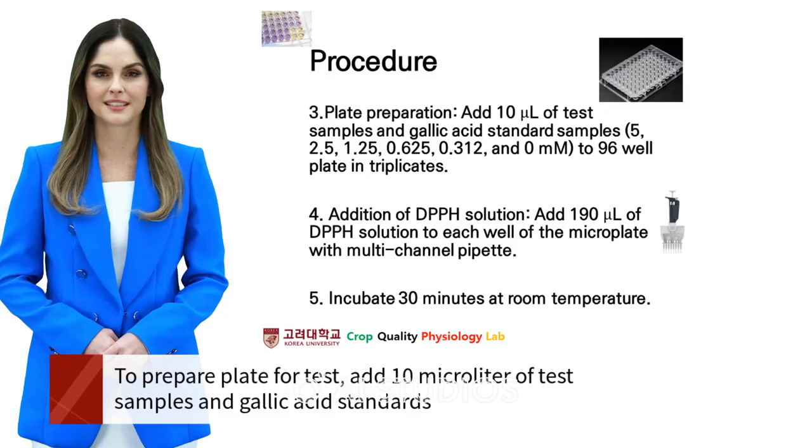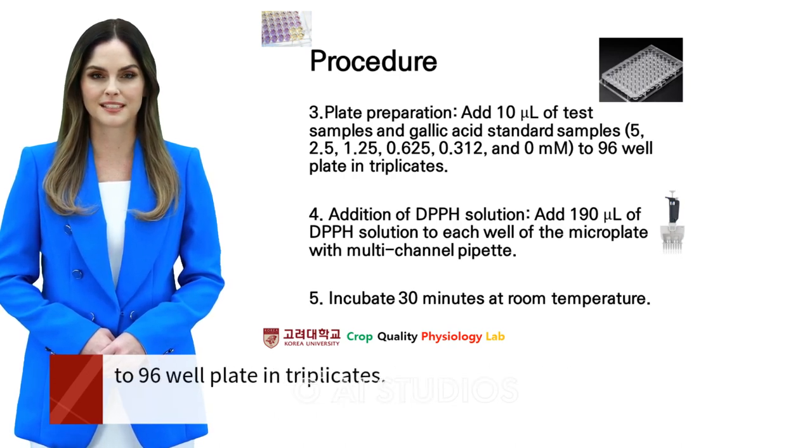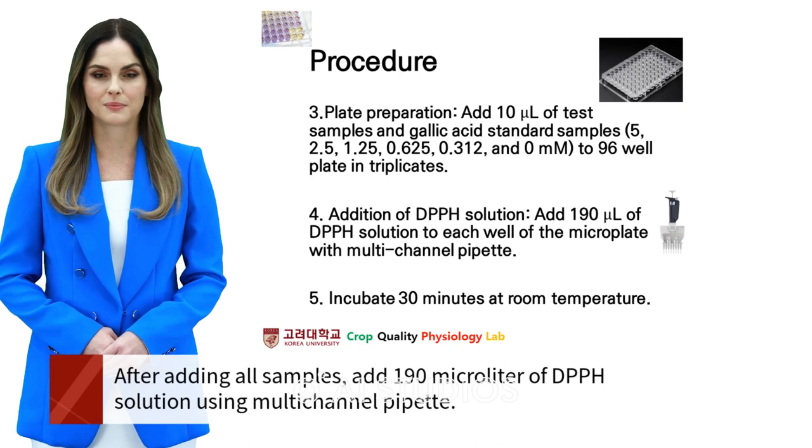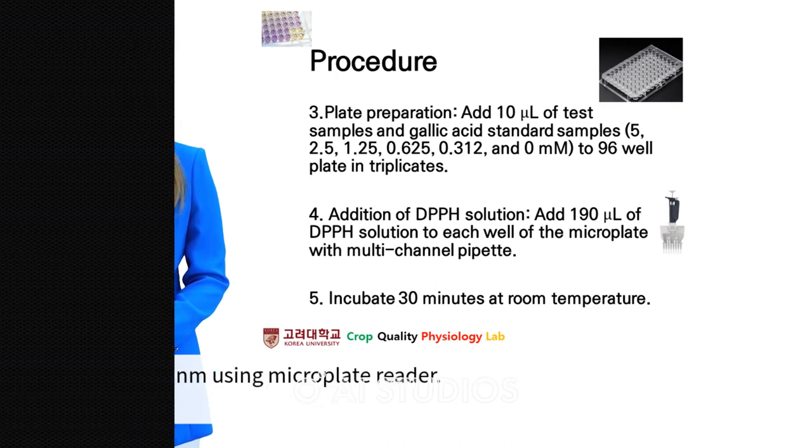To prepare the plate for test, add 10 µL of test samples and gallic acid standards to the 96-well plate in triplicates. After adding all samples, add 190 µL of DPPH solution using a multichannel pipette. After 30 minutes of incubation under dark condition, you can measure absorbance at 517 nm using a microplate reader.